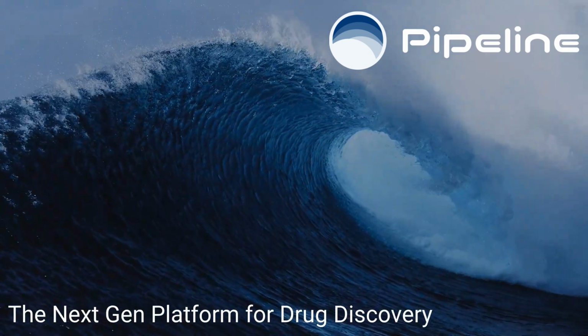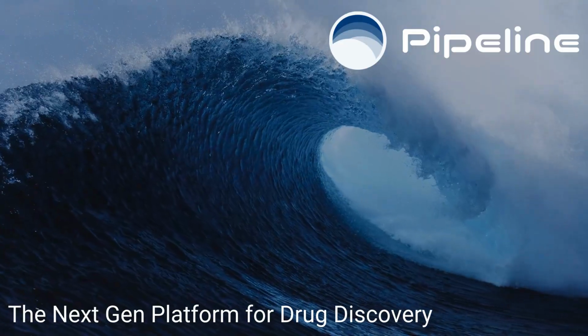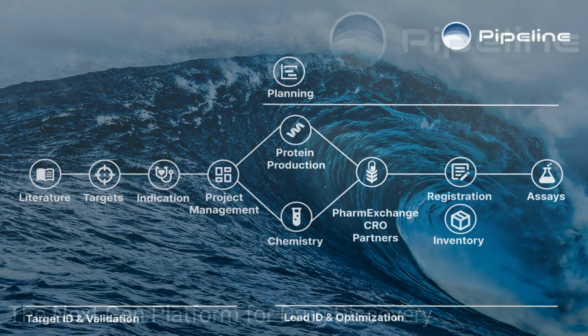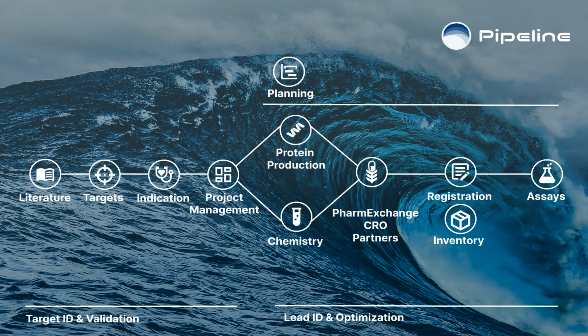Pipeline is the next-generation platform for drug discovery, designed to help you plan, manage, and execute your drug discovery projects. Pipeline's modular architecture is designed to support the drug discovery process from target identification through lead optimization.